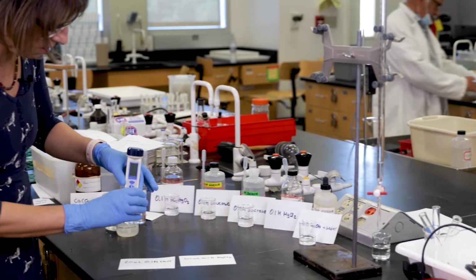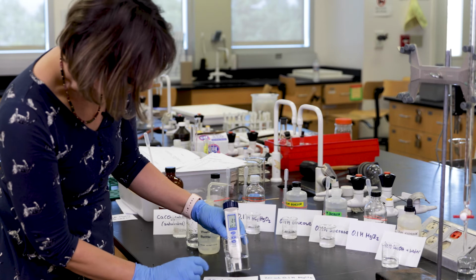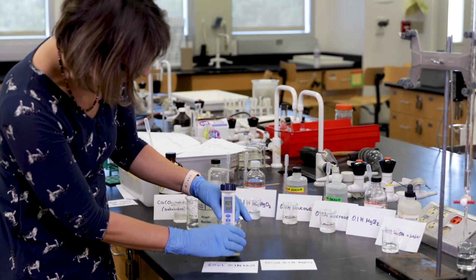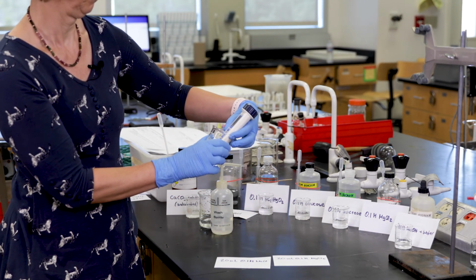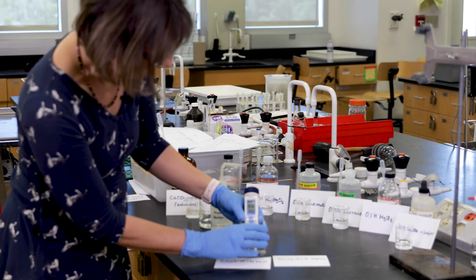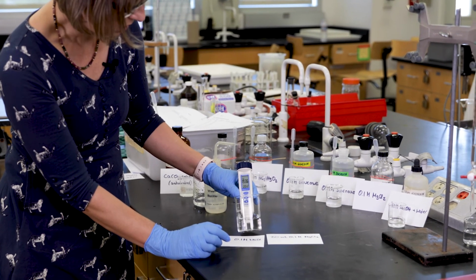Let's stir that a little bit. And the measurement, oh, it's switched off, but we're going to. Oh, so now it's switched scales. So now it's 1,936 microsiemens.